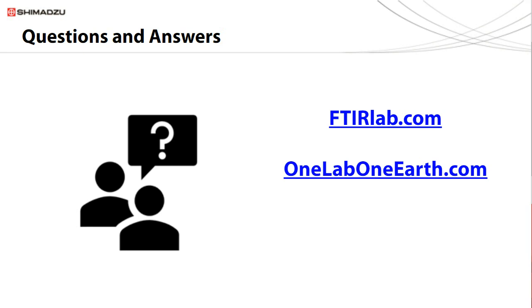The first question I have here is for Sudhir. Your data, especially the mapping, shows one type of plastic standard per analysis. Have you tried analyzing multiple plastic species at a time? If so, how complicated is the analysis? So in the images we've shown here, for the purpose of clarity and to avoid confusion, we've only used one type of plastic, or one sample, per image.